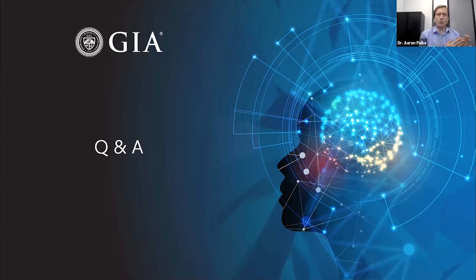I guess it depends on what you're looking at, right? If you're looking at spectroscopy, especially FTIR spectroscopy, FTIR is very good at picking up oil and grease and these types of things. So that's why it's good for identifying fillers in emeralds. But also, when you're handling the gemstone, you have oils and greases on your fingers, right? So typically we use some very mild solvent. You might use isopropyl alcohol in order to get that oil off of the stone.